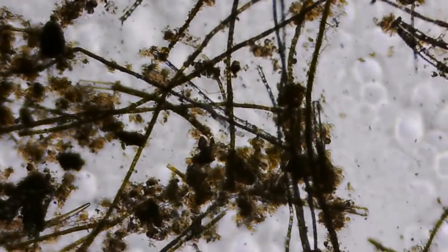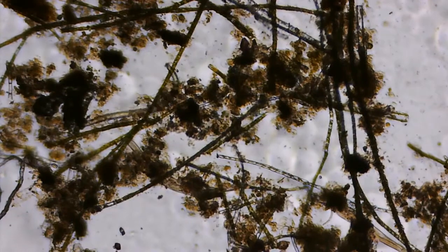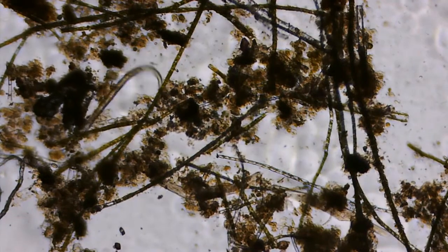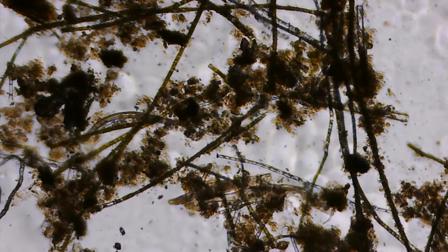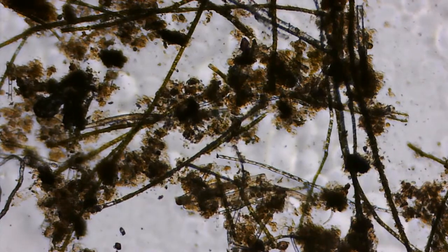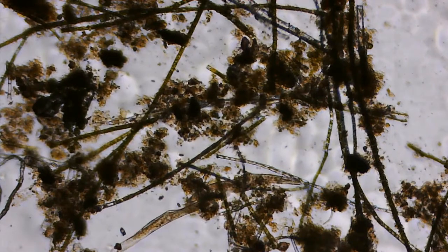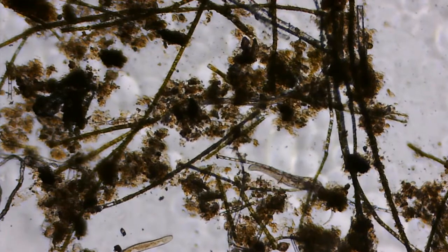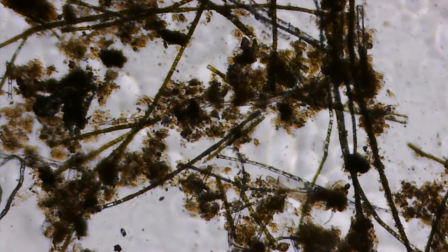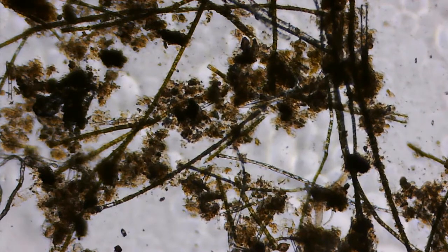We're moving along again. No, we're staying where we are. So we can see our squirming nematode there, and it looks like we've got two Spirostomum now. And don't be under any illusion that they're going to mate, they're probably just going to slide past each other. But you're really getting a better view of what they look like now. Look at that flattened end, it's very clear because that is the contractile vacuole you saw on the left. It's going off screen now. And the Spirostomum on the right, it's hiding itself behind some algae. And we've got our little nematode there squiggling in the middle.